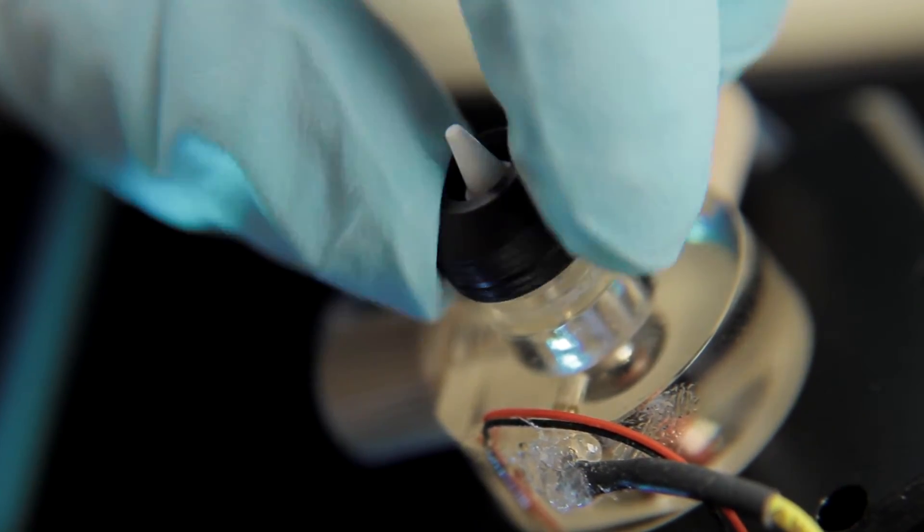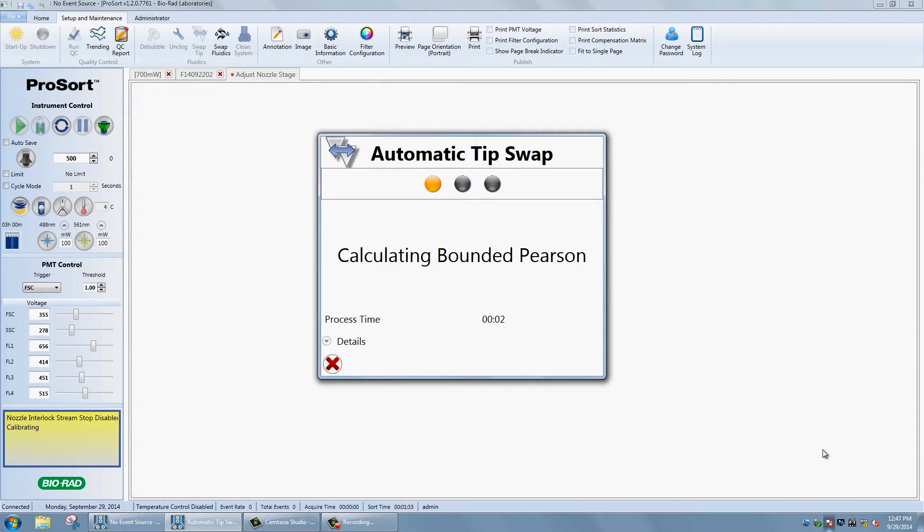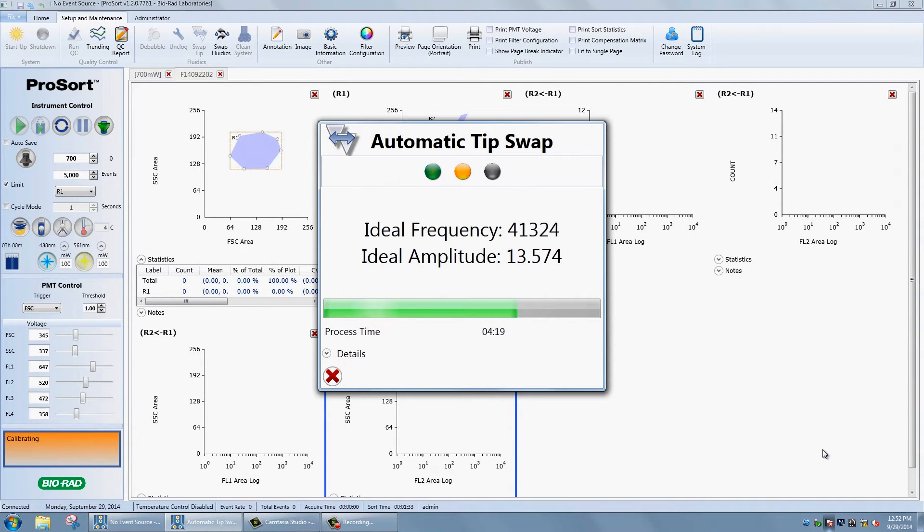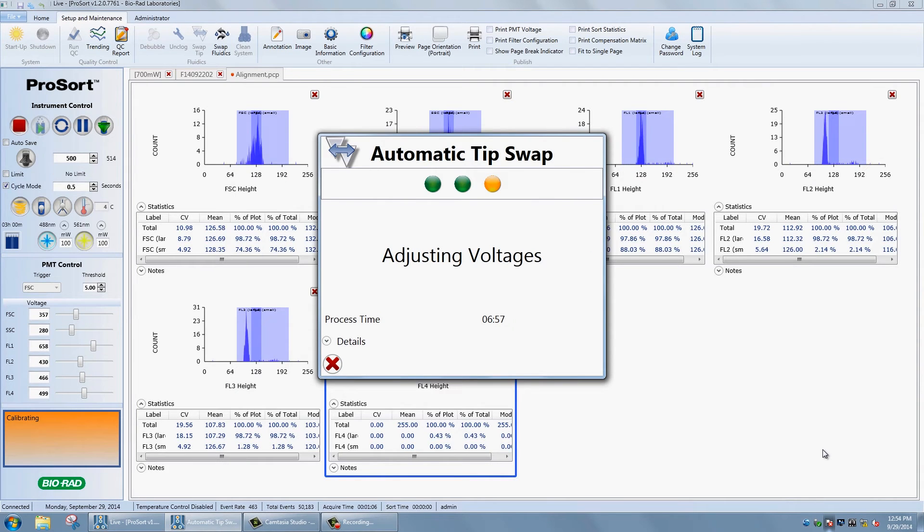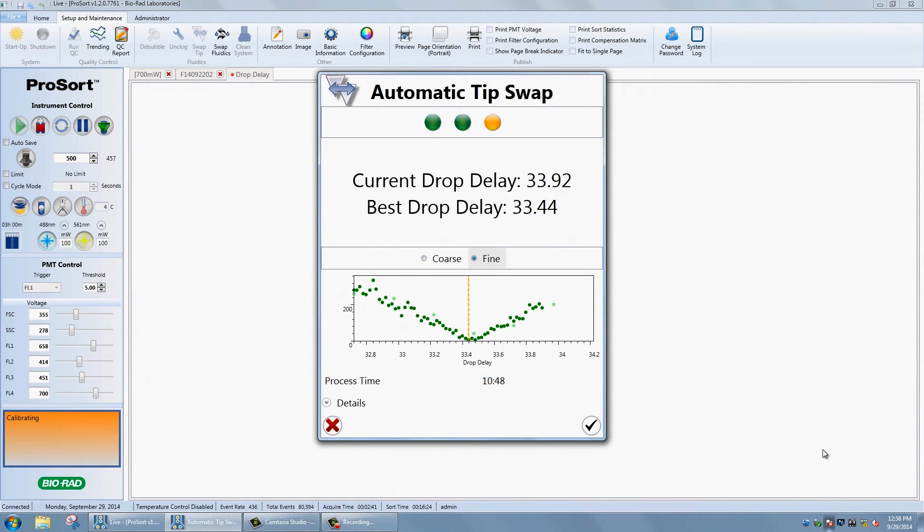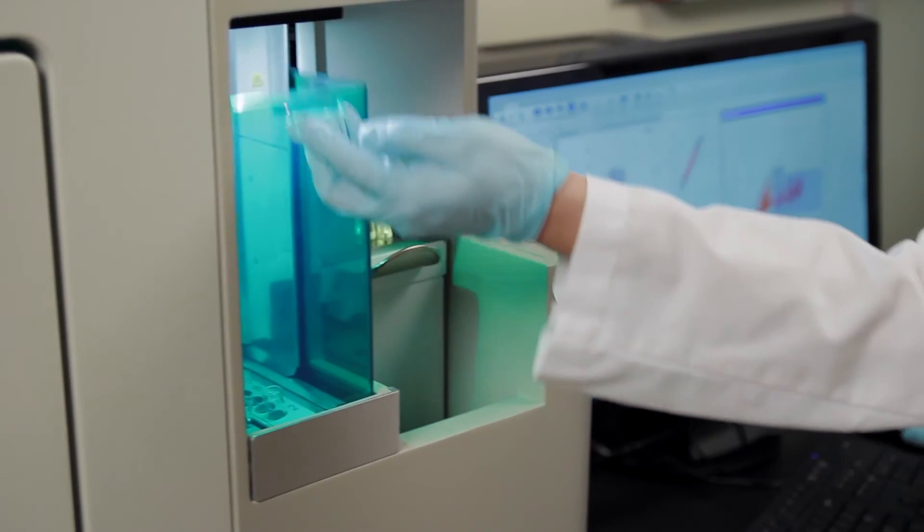Once you've reinstalled the nozzle tip, the software does the rest of the work. Sophisticated software algorithms make accurate micrometer adjustments to find the ideal tip alignment, amplitude, and frequency. The software then proceeds directly to a quality control procedure and drop-delay calculation. All of this is done automatically so you can walk away and feel confident that your cell sorter is set up correctly.